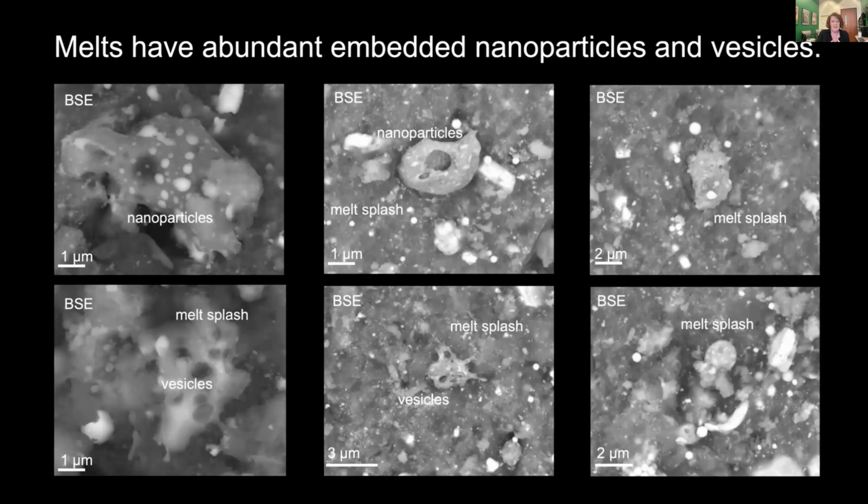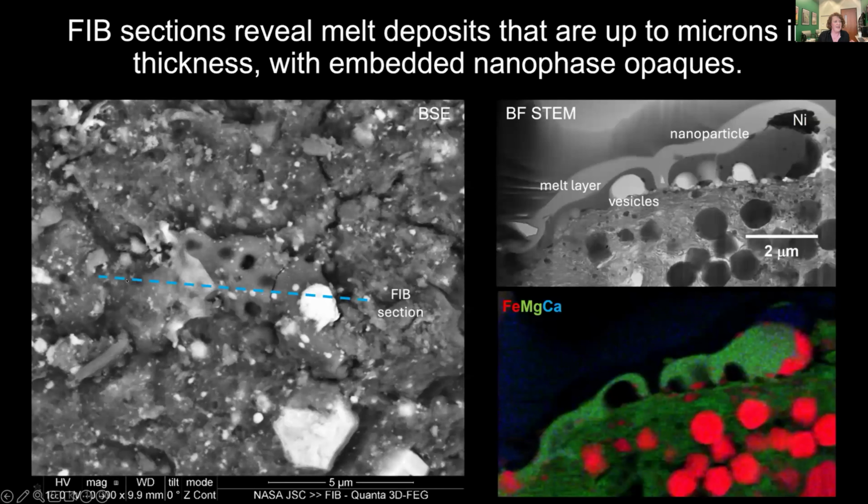And so we wanted to understand exactly what their composition was, what their distribution was, in order to understand what influence they might have on the spectral or optical characteristics of the sample. So to do that, we can take FIB cross sections to look at these melt deposits in the transmission electron microscope. This is an example of one of those transects that we looked at in the TEM. So now you're looking at the surface of the sample here and going into the grain interior in this direction. And this amorphous material at the surface, this is all the melt deposit.